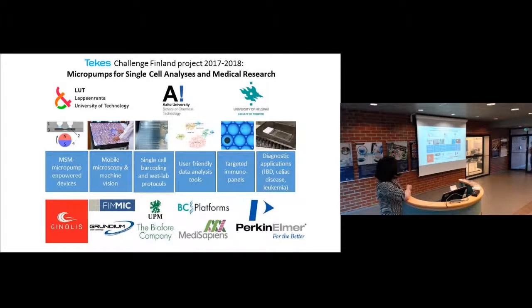The group from Lappeenranta University of Technology, Kari Ullakko's group, has these very clever magnetic shape memory metal micropumps, where you can have a tiny layer in those microfluidic chambers or in these channels. You can place tiny pieces of that metal, and when you have that chip on top of a magnet, which is rolling, then this rolling magnet makes this metal layer work as a peristaltic pump, very accurate, very fast.